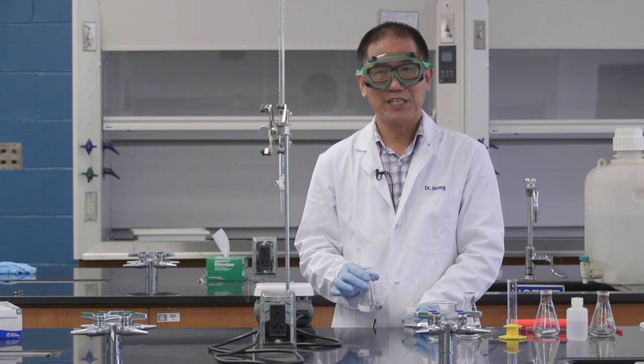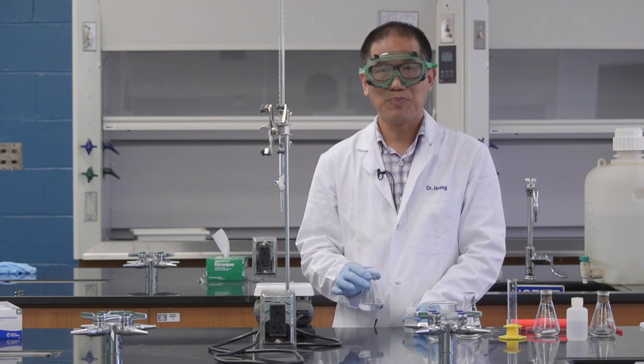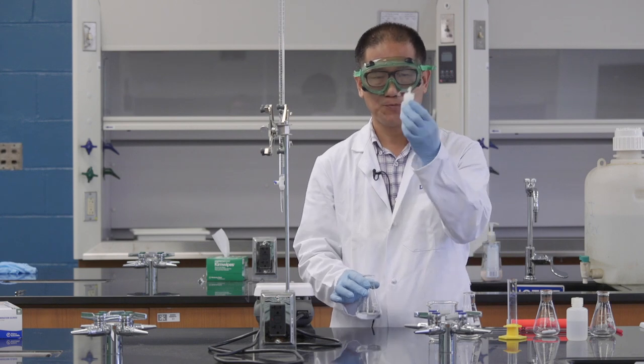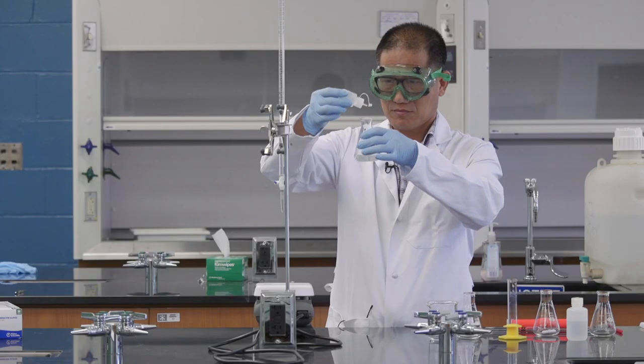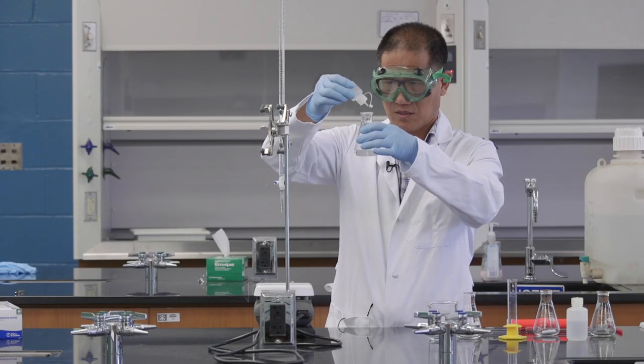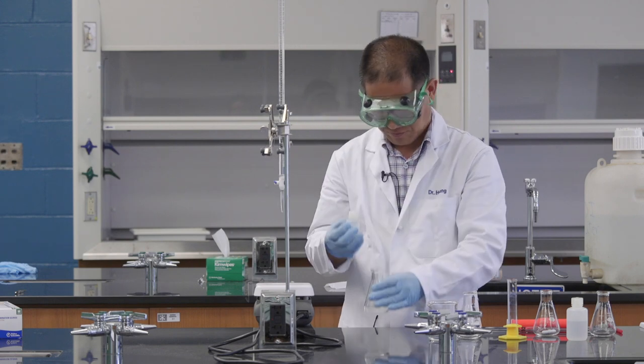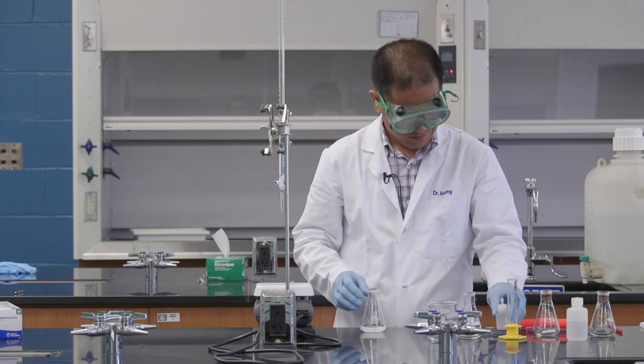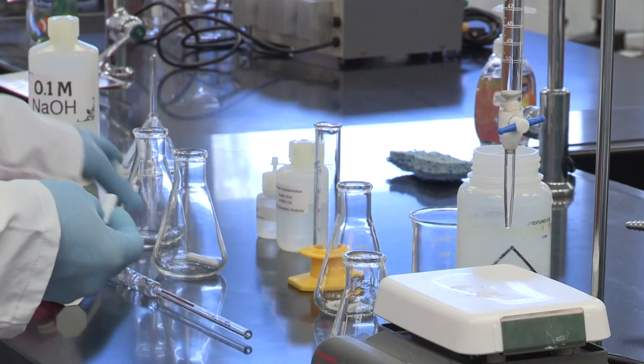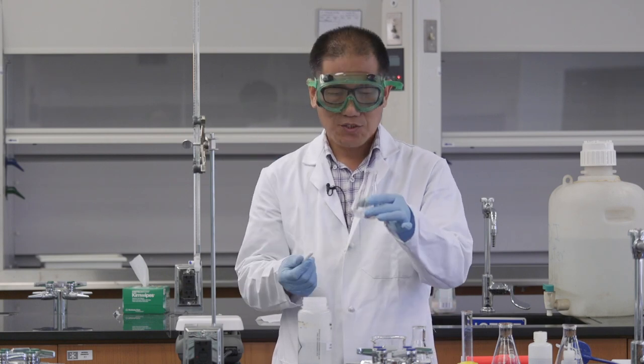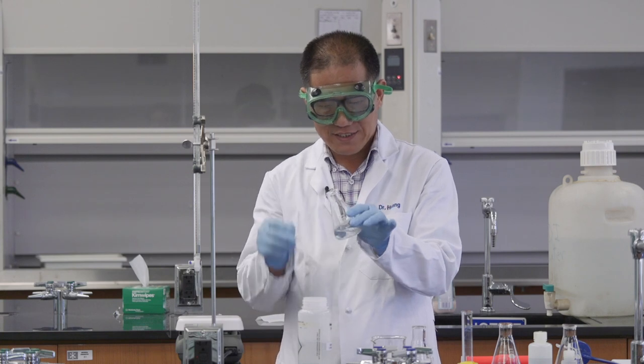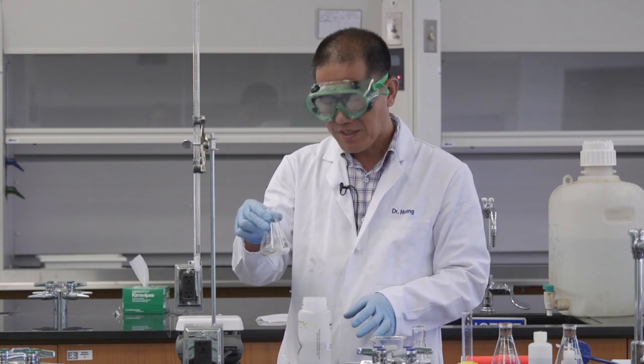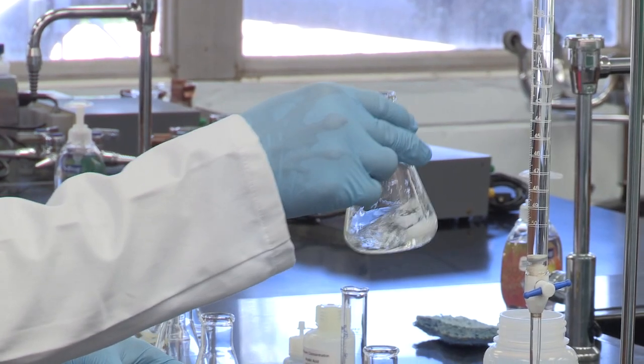After you dissolve the KHP, don't forget to add the acid-base indicator, which is in this small bottle. You only need to add about three to five drops. Now, I'm going to add the stir bar into this Erlenmeyer flask. I want to stir that so the dissolving can be very fast. At the same time, I can swirl this so it will dissolve faster.